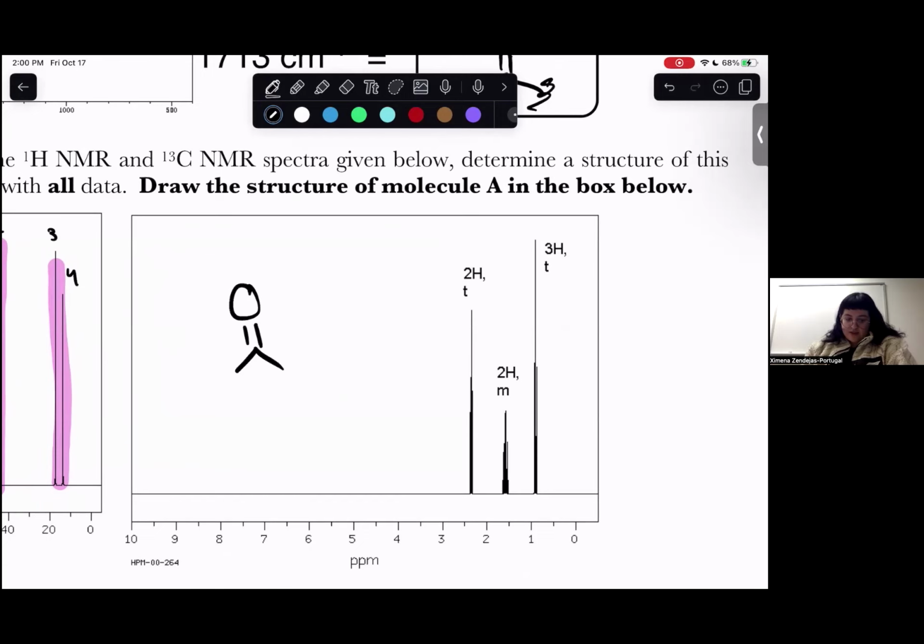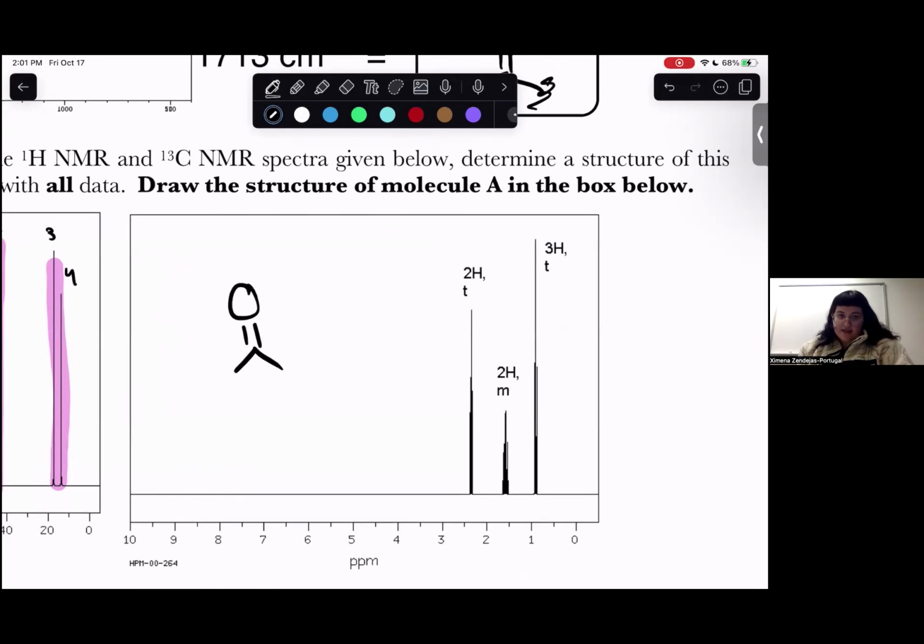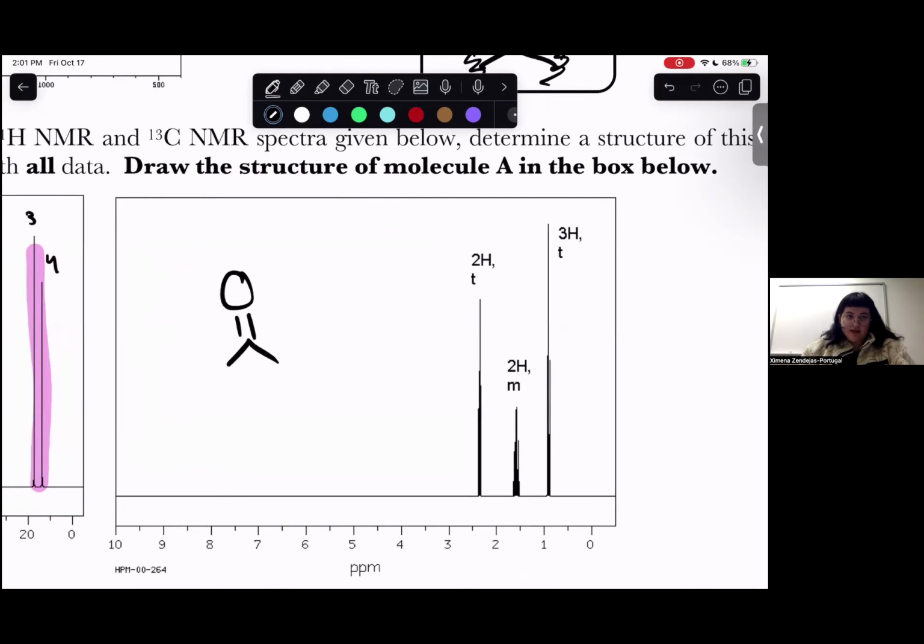Looking at this, we can look at the multiplicity of the peaks as well as correctly assigning the correct amount of hydrogens to each carbon. And this oxygen double bond acts as the symmetrical point like Joe had explained. So going off this, we know that this one carbon is a symmetry, so there must be 3 carbons to each side of it. So 1, 2, 3 at that end.